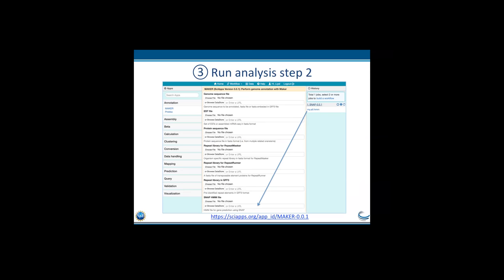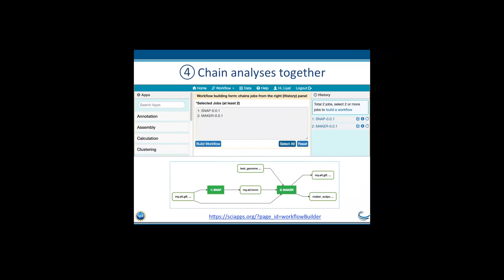Now I have two steps done and I can chain them together. I click on the select box in the History panel for each job, then click on the Build Workflow link at the top. That brings up the workflow building form. A diagram pops up once you click Build Workflow, which shows the relationship between inputs and outputs. Clicking on each node directs you to the file — whether input or output. Clicking on an app node, colored in green, means it's completed and will direct you to the documentation of the tool.